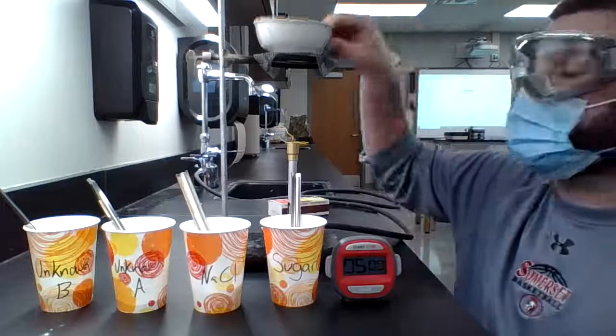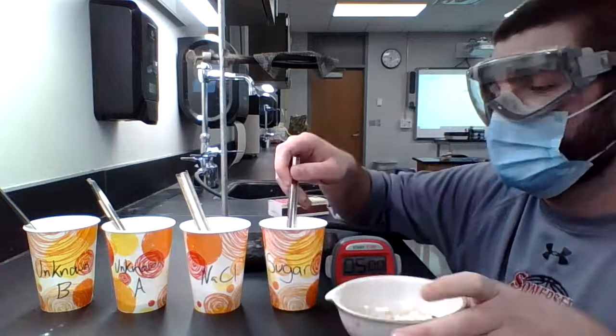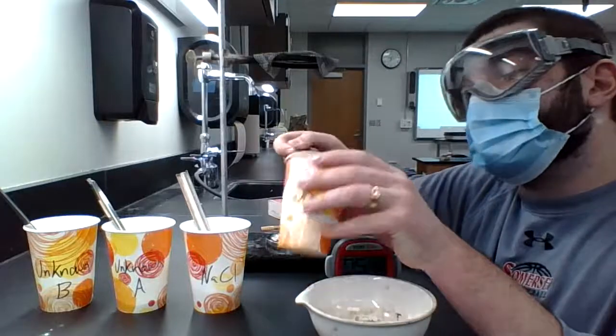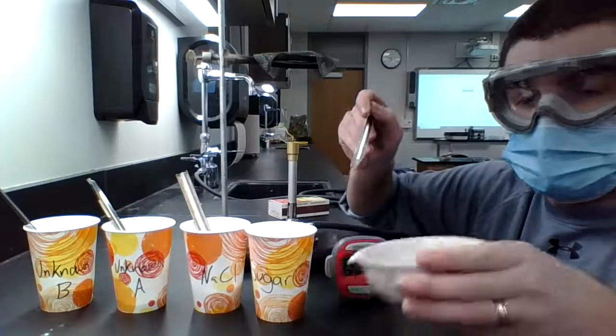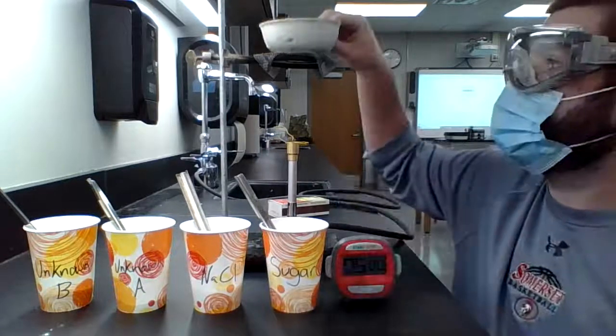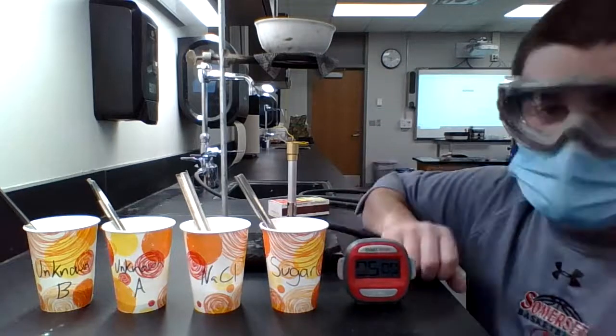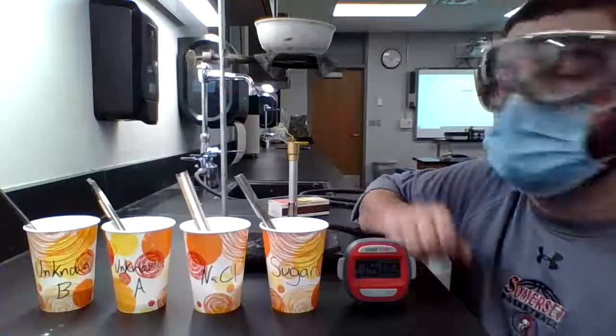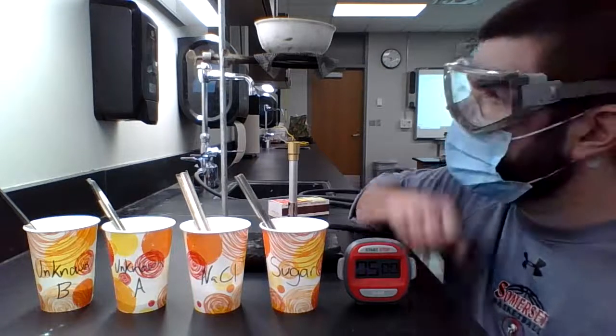What you're going to first start to do, you're going to take your evaporating dish, you're going to take a small sample, just a little spoonful, it doesn't need to be much. And you're just going to pour it into your bowl like so. And you're going to let it sit in the middle. And then I'm going to set this up on my wire gauze and my ring clamp. My timer is set to five minutes.